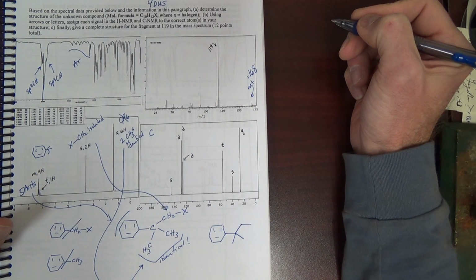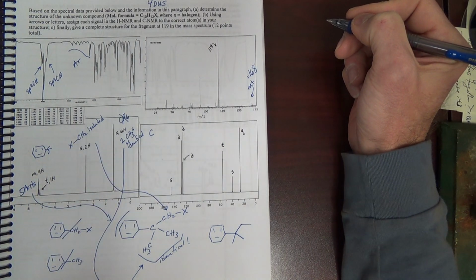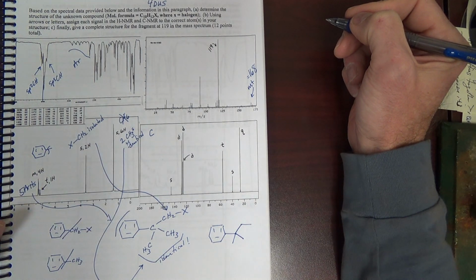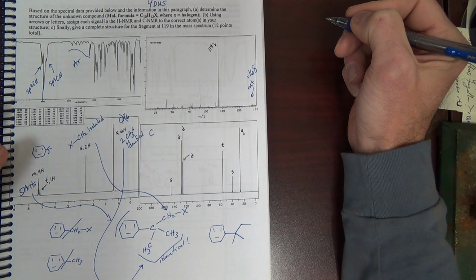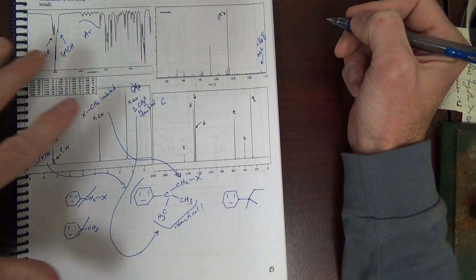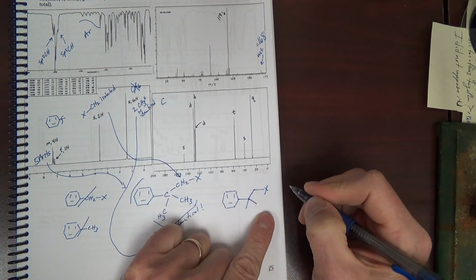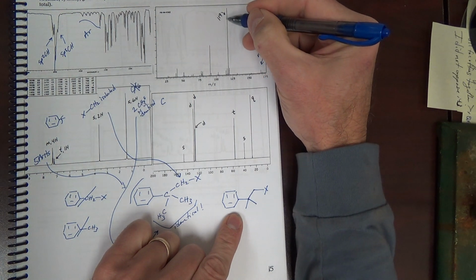Hard to see here. Well, I'm going to keep this X for a minute here. 119.